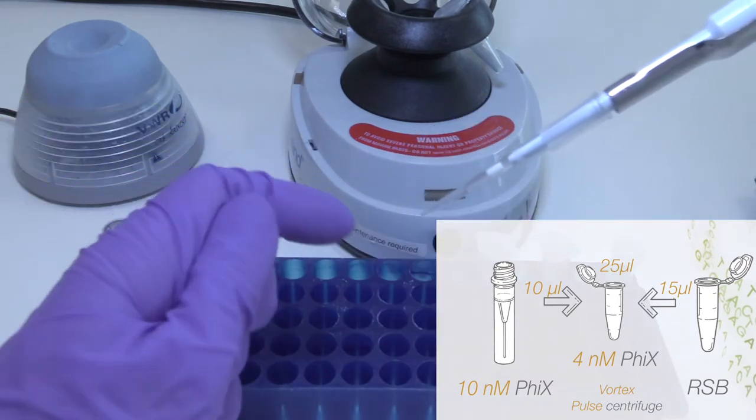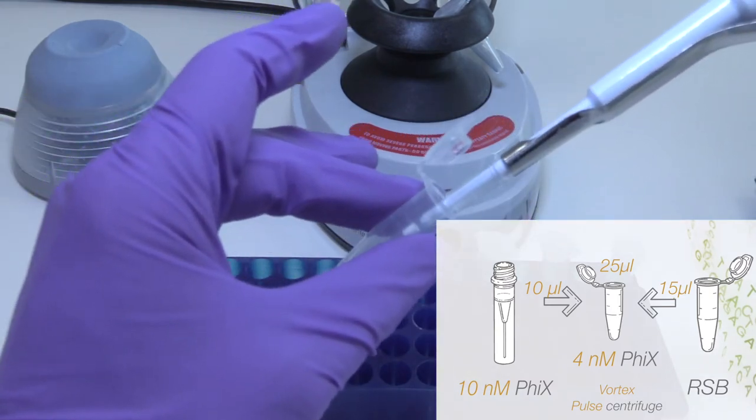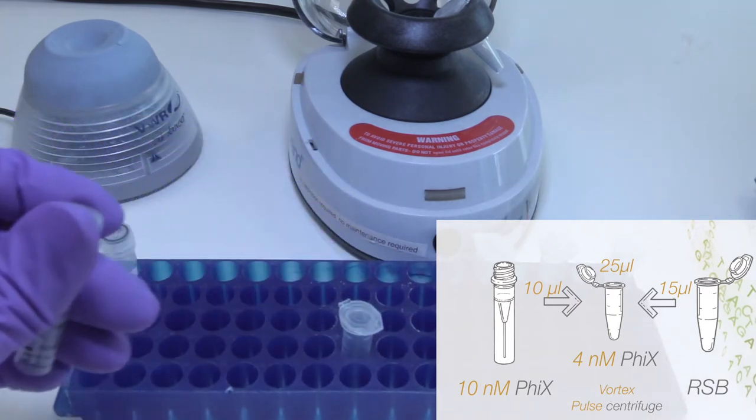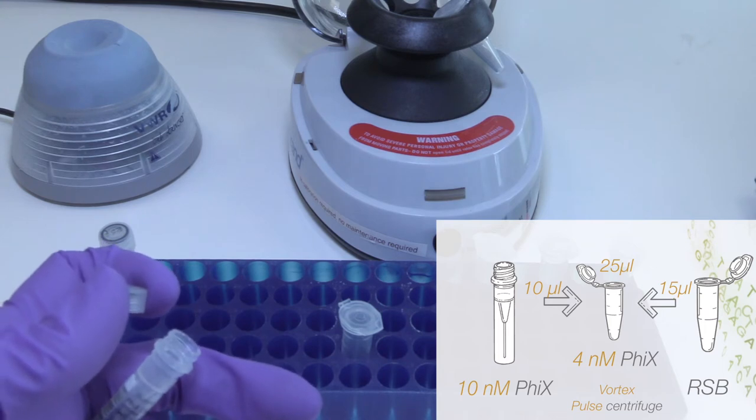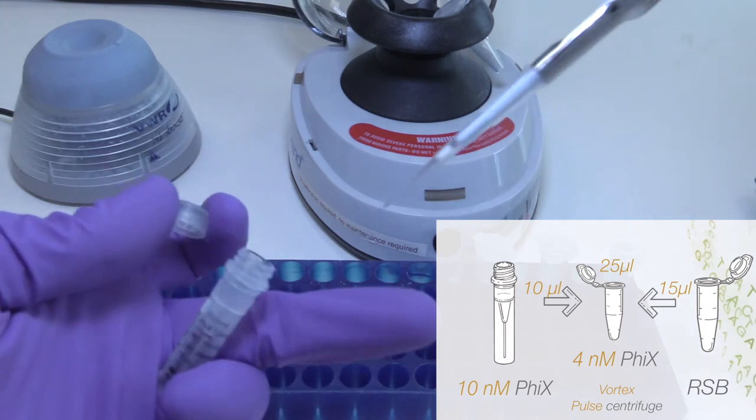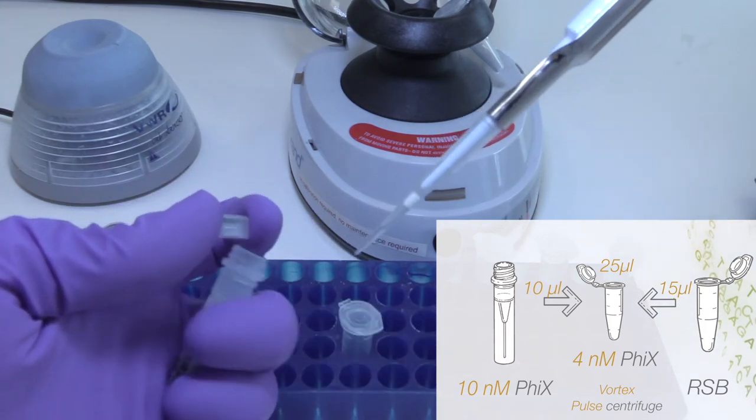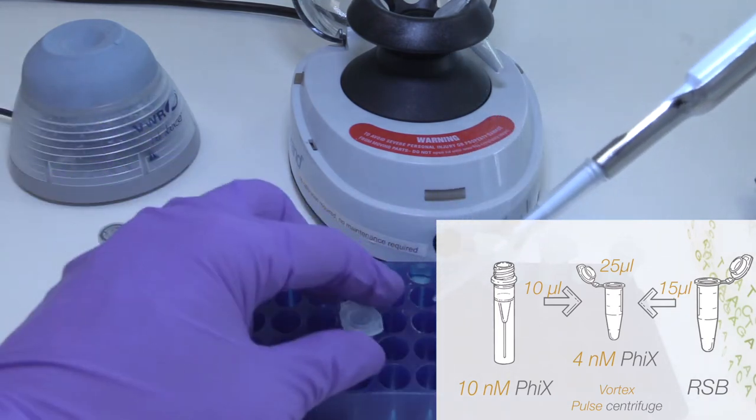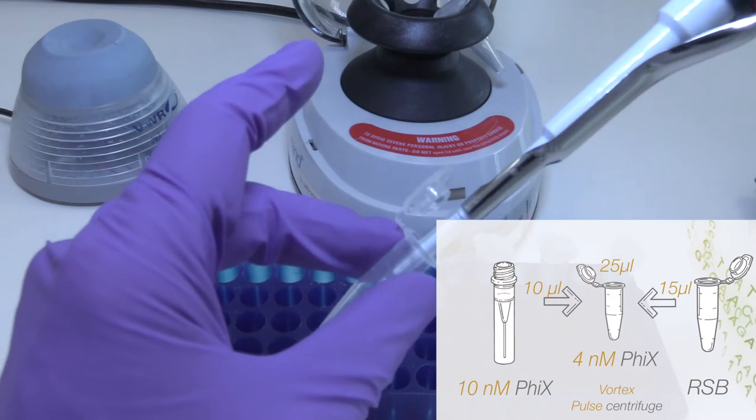Combine the following volumes in a microcentrifuge tube: 10 microliters of Phi-X at 10 nanomolar and 15 microliters of RSB. This will make a total Phi-X volume of 25 microliters at 4 nanomolar.